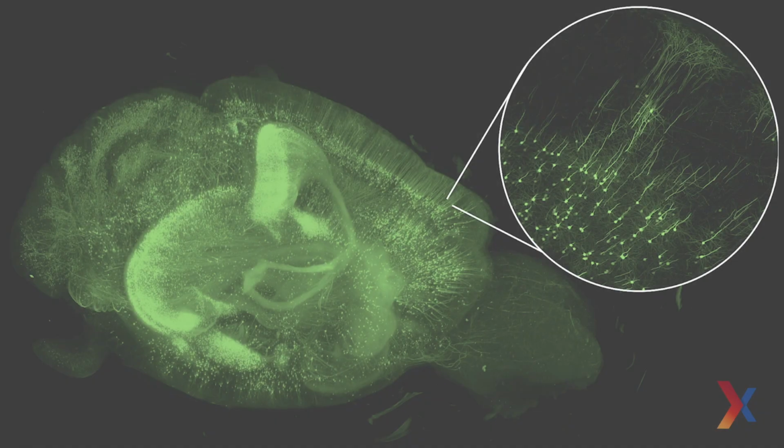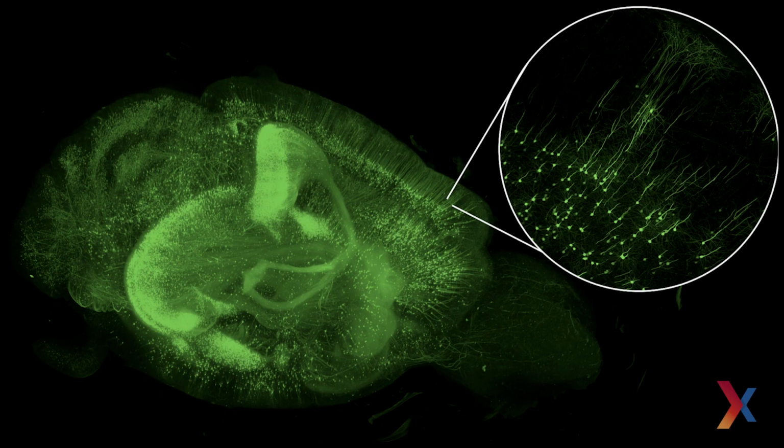GFP was discovered in around the 70s, and since then it has been turned into a pretty ubiquitous and versatile tool. Different derivatives of GFP have been made that can actually fluoresce at different colors, and GFP is such a powerful tool because it is non-toxic and it's not destructive to the cell. This allows us to be able to image cells without destroying them or altering them. In this first example that I'm showing you here, GFP has been expressed in cells by itself. It has been put next to a promoter that is specific for neurons, allowing it to be broadly expressed within neuronal cells.